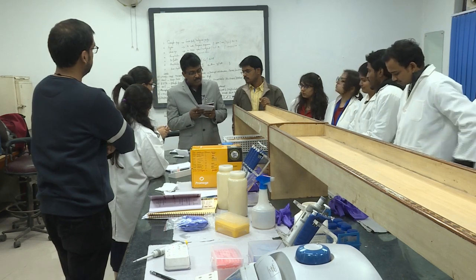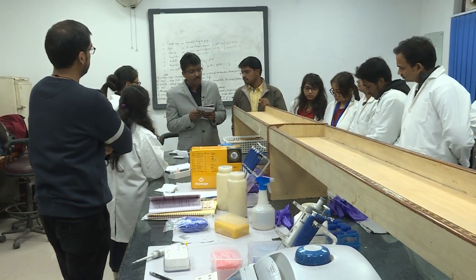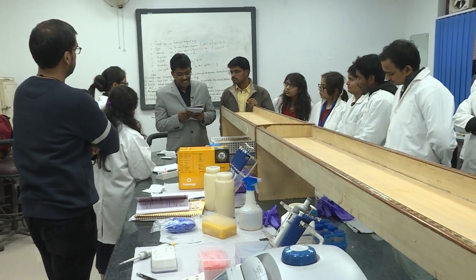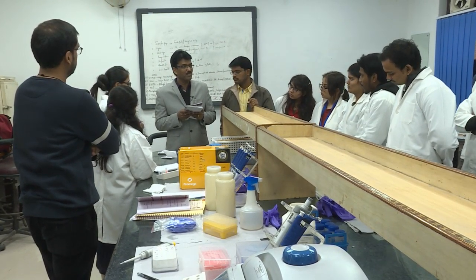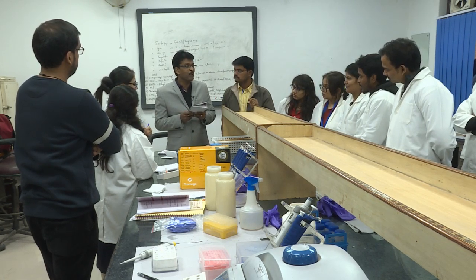They have two samples. Sample number 1, the reading is 1.74. Right. Another sample, it is 1.64. The reading is so perfect. The reason is they used a Promega kit.